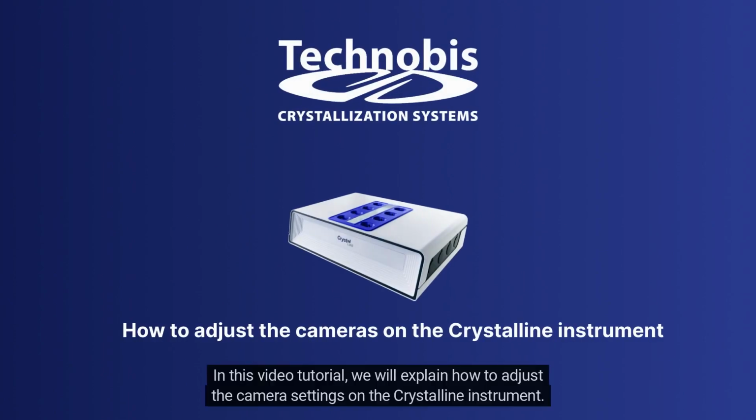Hello there. In this video tutorial, we will explain how to adjust the camera settings on the Crystalline instrument.